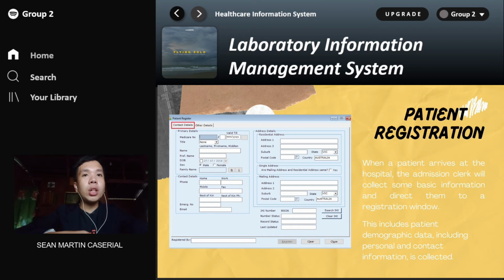So all they need to do is to have this patient registration to acquire the names, the date of birth, your gender, your address, your present address, your permanent address. If you are just a tourist here in the Philippines, or you live in another country, you just visited here, or you are a Filipino citizen. So this is the purpose of the patient registration.